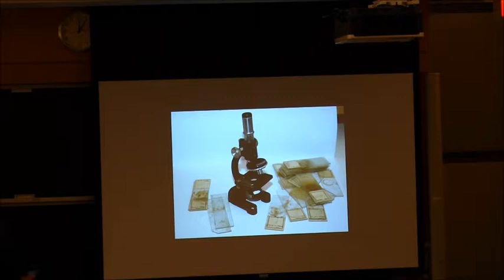It wasn't until basically the 90s, when confocal became commercialized and more popular, that when looking at biological samples under a microscope, we actually started looking at things that were thicker than just these really thin, tiny sections. We started to have the ability to do optical sectioning and build up 3D images once we had some fluorescent staining of that tissue. But again, that still ran into problems.